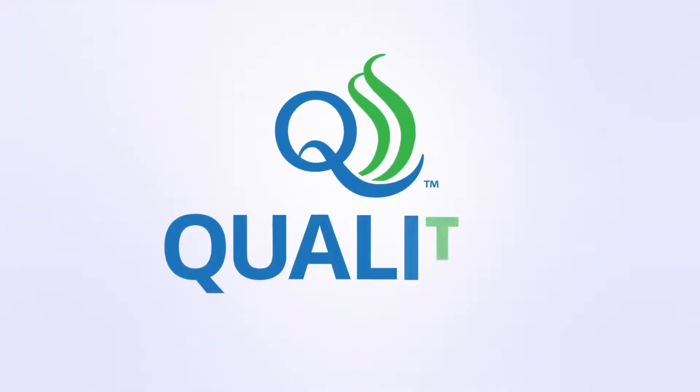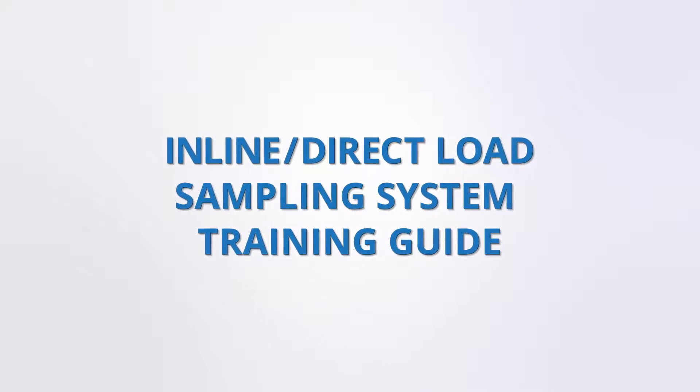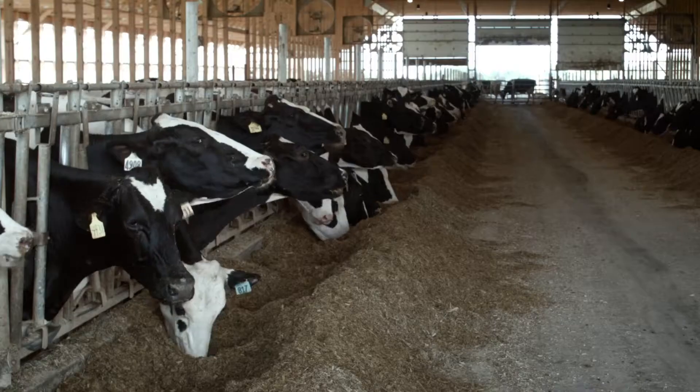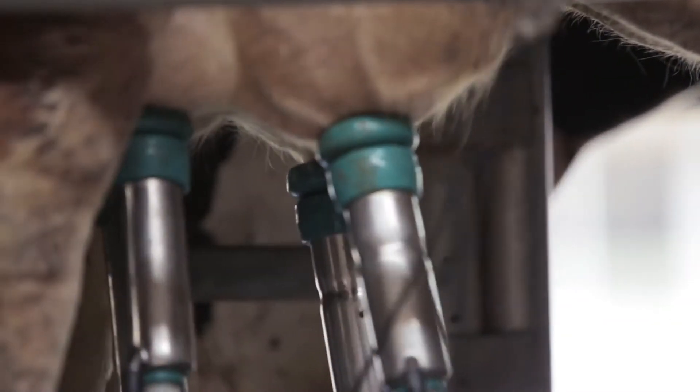Welcome to the QualiTrue Sampling System's In-Line Direct Load Sampling System Training Guide. The following tutorial will demonstrate the proper method for collecting representative raw milk samples from a QualiTrue In-Line Direct Load Sample System.